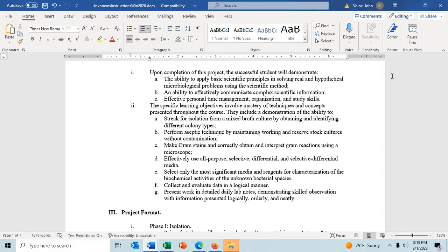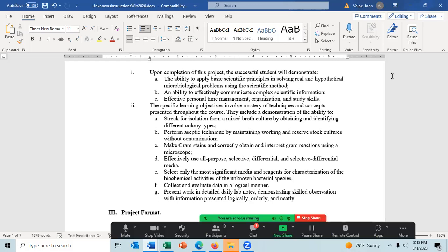Go ahead, Jaden. Oh, my question was just for the species under consideration. Is that just supposed to be based off of what you are thinking it is going to be, and you just have to write that down? No, you'll get the first 3 tests. So you record the results of those tests and conclusions, and then go to the chart and figure out what species are under consideration after that. Oh, okay, yeah, I see what you're saying.